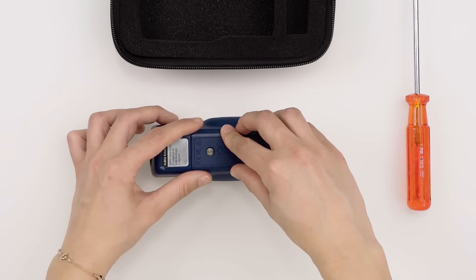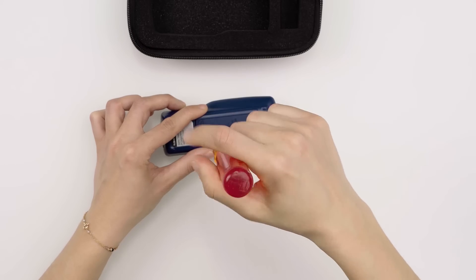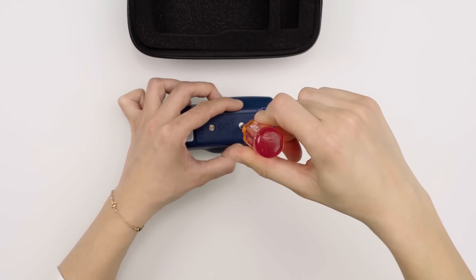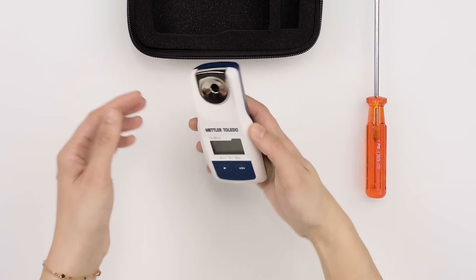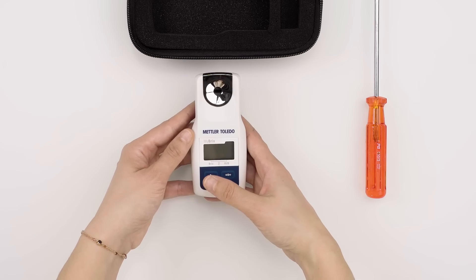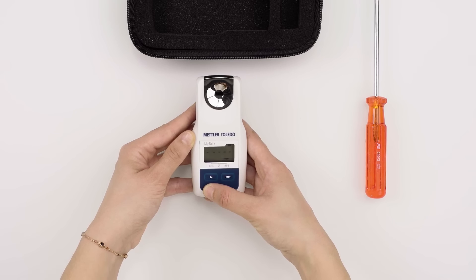Turn on the instrument by pressing the read key. The instrument is now ready to be used.